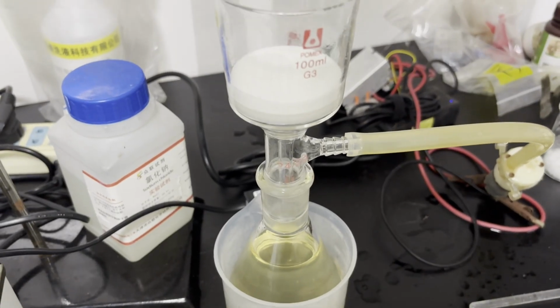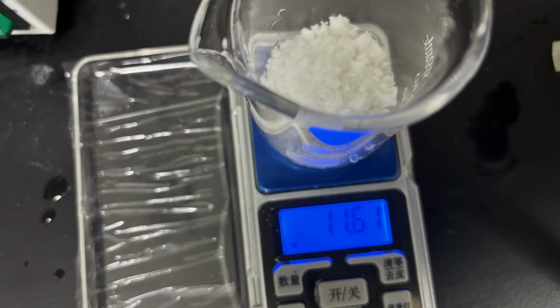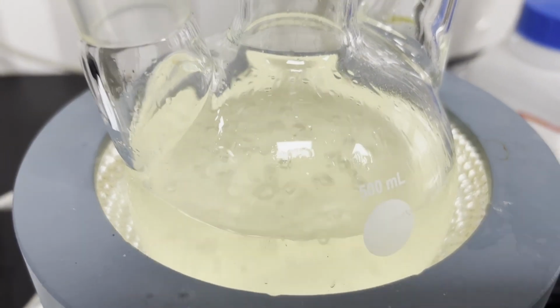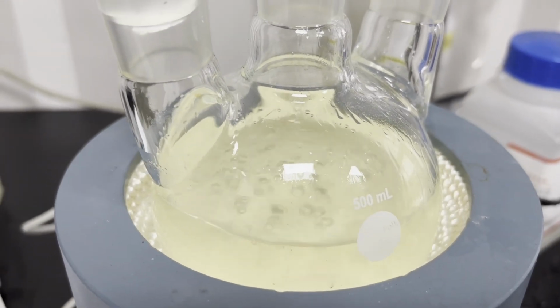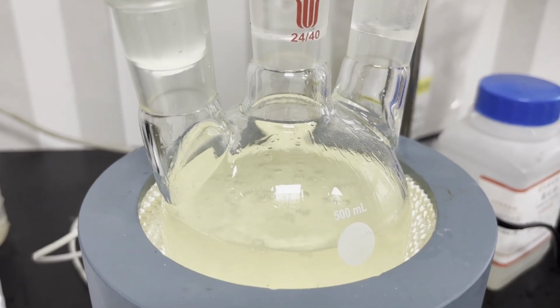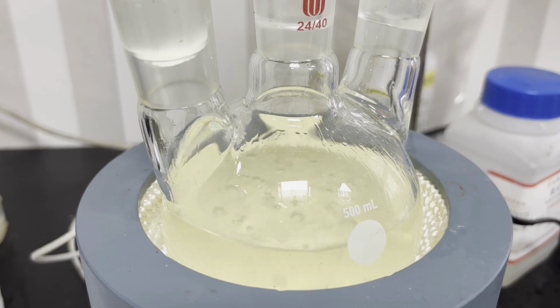The crystal in the flask is filtered as well, and their mass is 11.61 grams, which renders the total yield to be 18.54 grams, or 60.2% based on hydrazine sulfate. A discussion about optimizations will be included afterwards, because right now, I'm going to make some potassium.